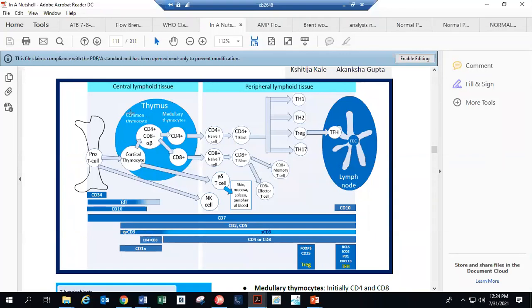Cytoplasmic CD3 is more of an immature marker, and it will be dimmer or negative in the other T cells. And as I said, the early common thymocyte will be CD4, CD8 double positive, alpha beta.